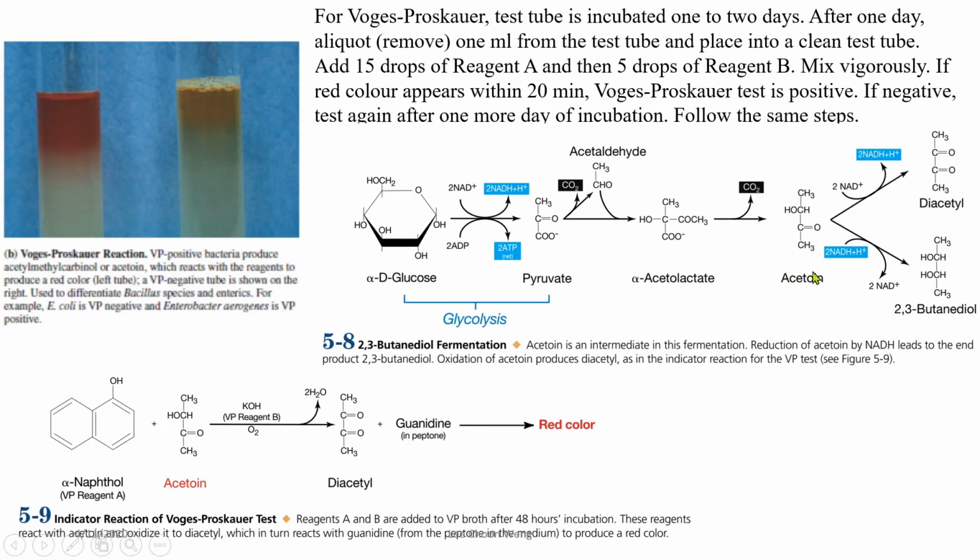If it is negative, we will test again after 1 more day of incubation. So the testing is done after 1 day and after 2 days of incubation. That is for the MRVP test.